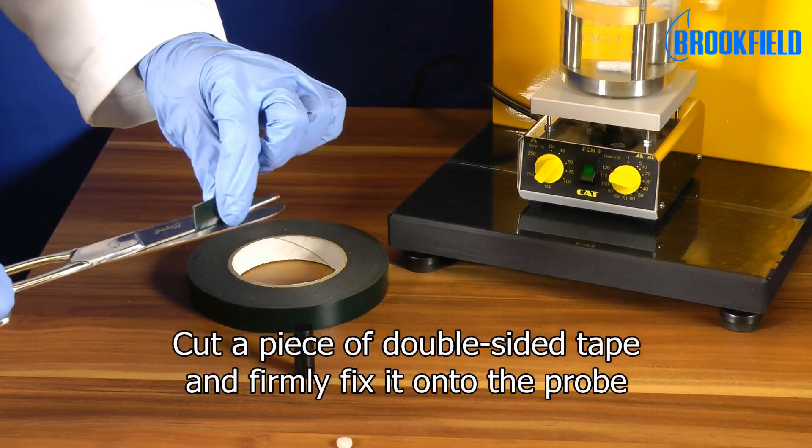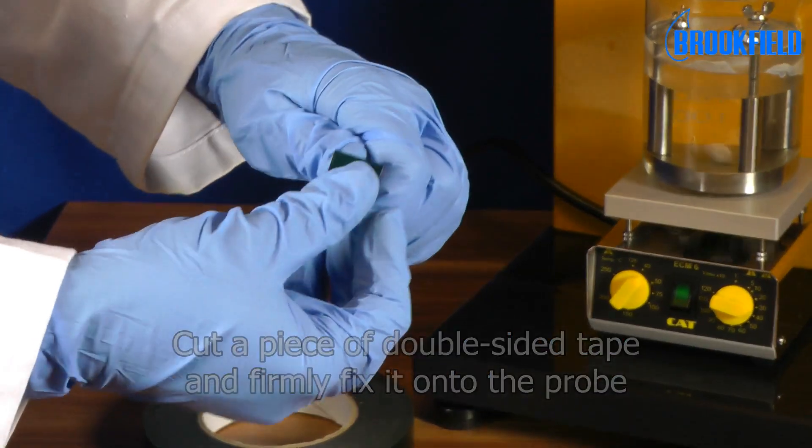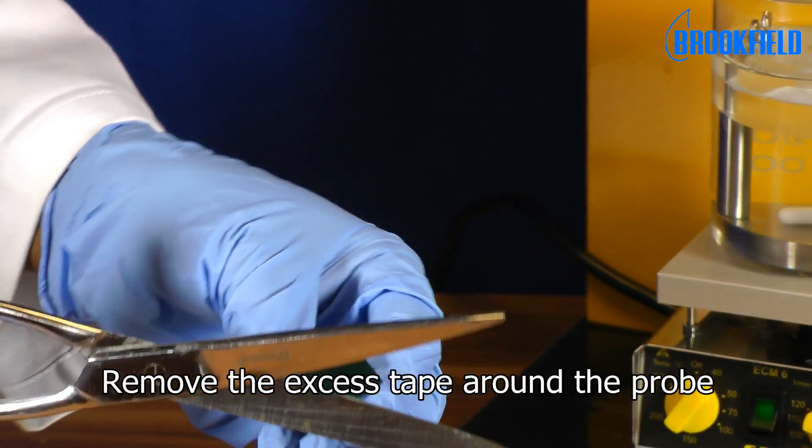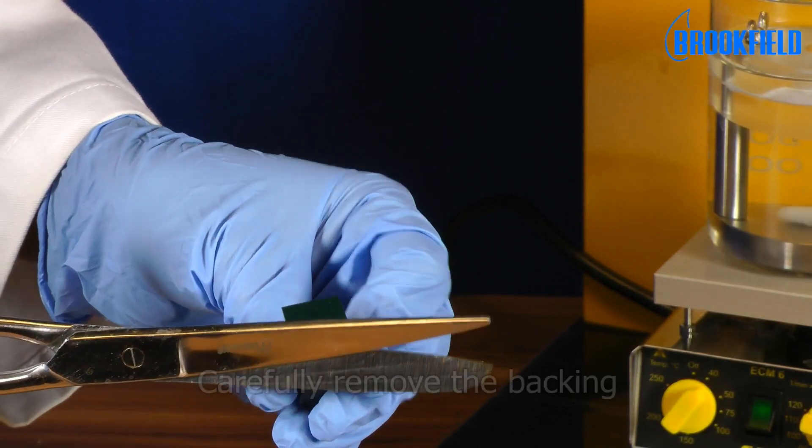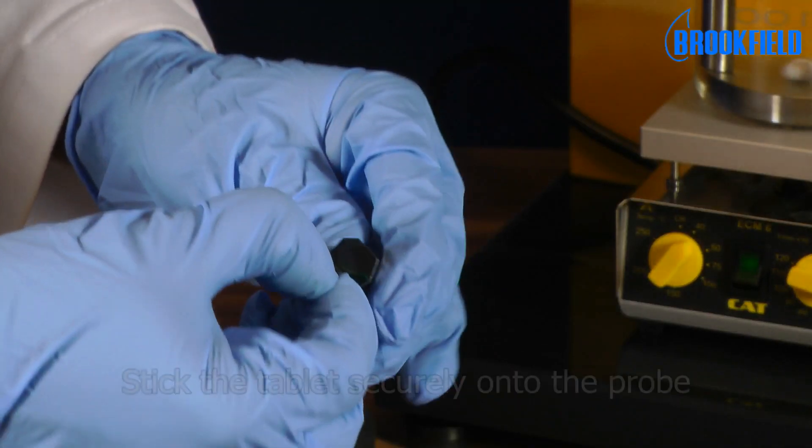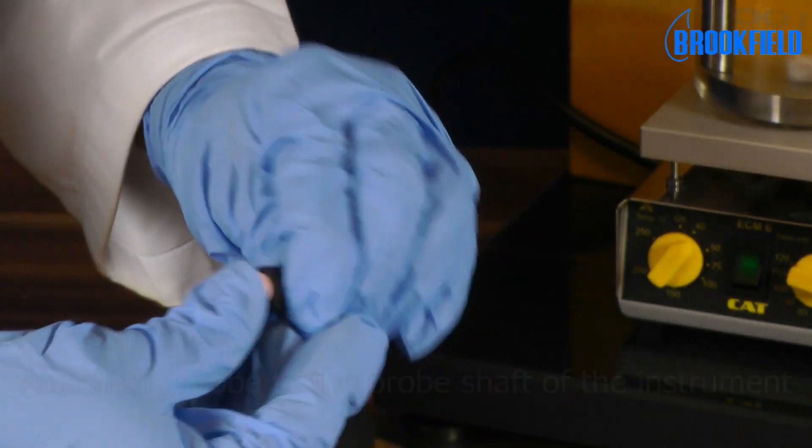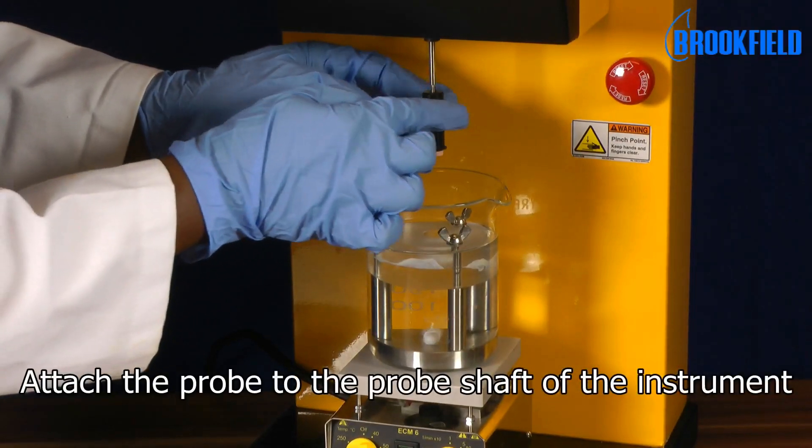Cut a piece of double-sided tape and firmly fix it onto the probe. Remove the excess tape around the probe and then carefully remove the backing. Stick the tablet securely onto the probe and then attach the probe to the probe shaft of the instrument.